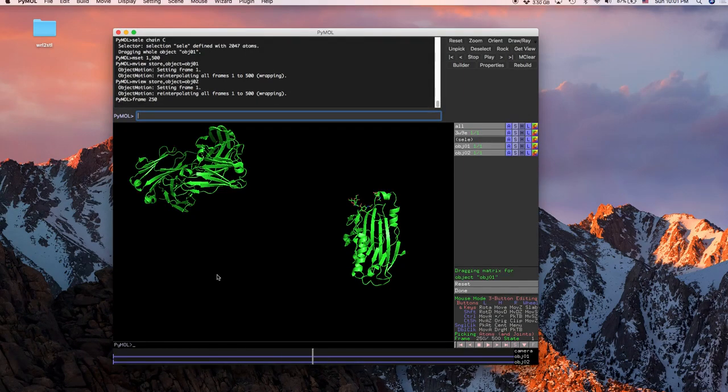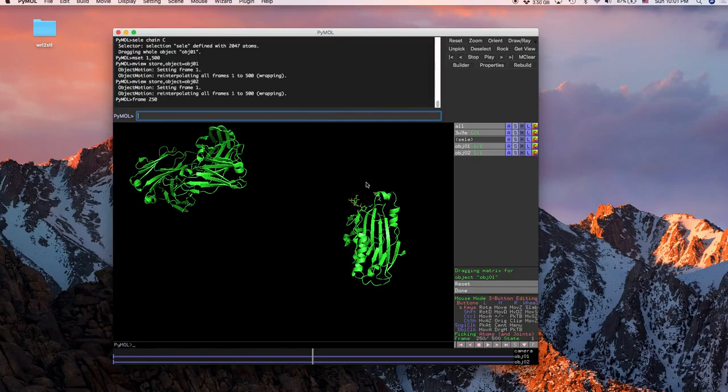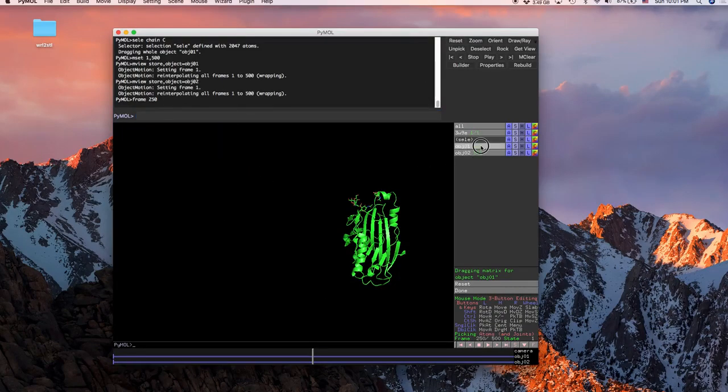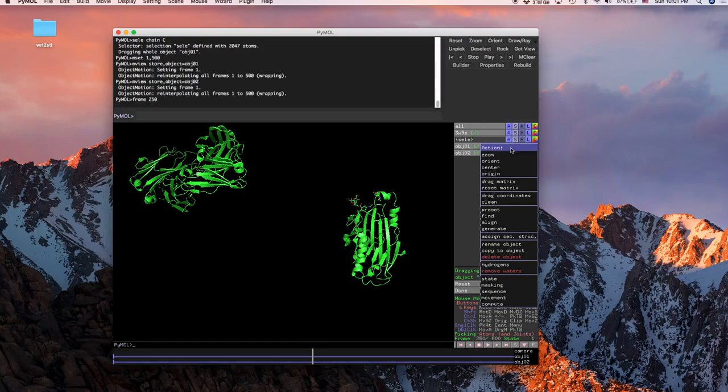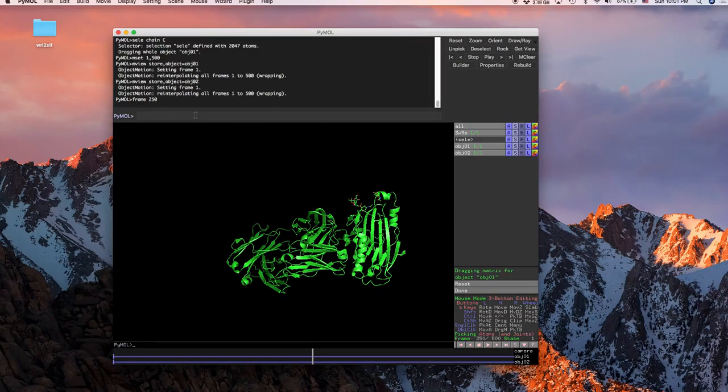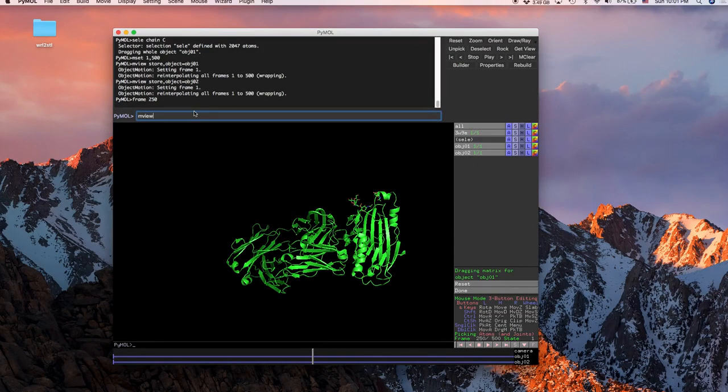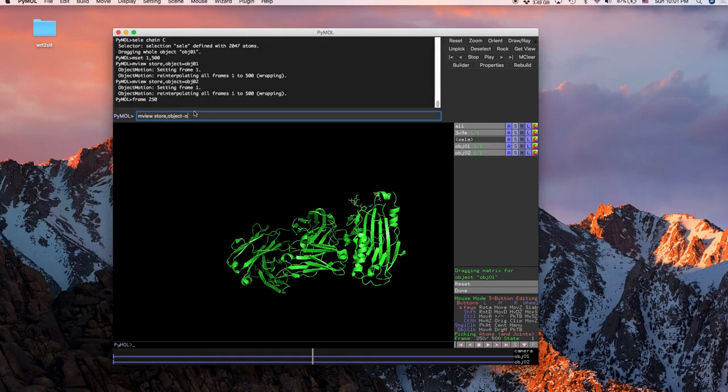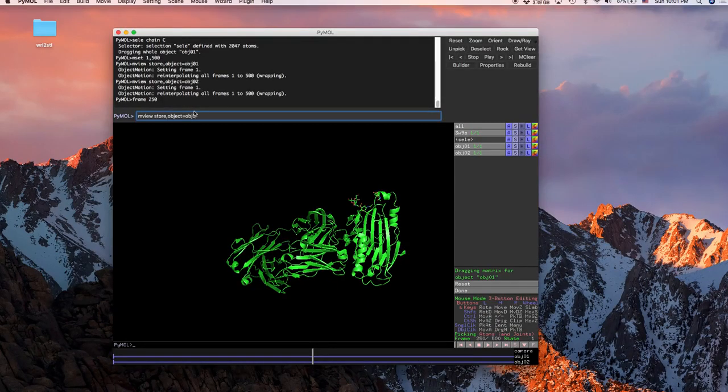And then to get this back to where it started, because you could have dragged anywhere, go ahead and find the object that it is, click action again, and then just reset the matrix and it'll put it right back where it started. And then we're going to go through that same process before: mview store comma object is equal to obj01, enter, then the same thing again with 2, enter.